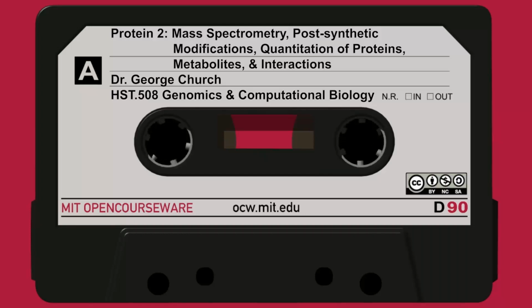Now, in slide 29, we have the alternative, which is by far more commonly applied. An example of the alternative, which is, you tell me the sequence, I'll find it in my data, is SEQUEST, where you're basically calculating the spectrum that you might expect for each peptide that you might expect in a genome. So you basically use the genome to predict the protein coding regions, use those to do an in silico digestion with trypsin. You basically cleave after every lysine and arginine, and maybe after some other ones. There are complicated rules where trypsin doesn't always cleave after lysines and arginines, and sometimes there'll be other proteases present, and you have to take those into account.